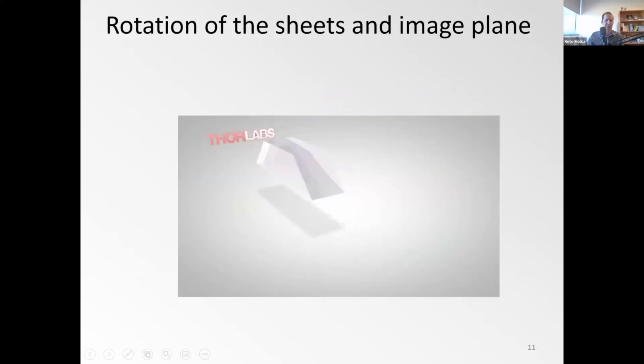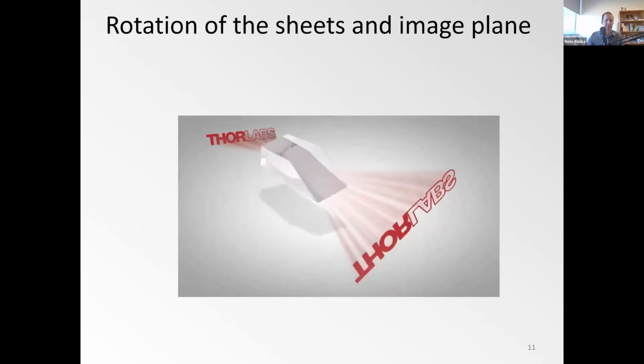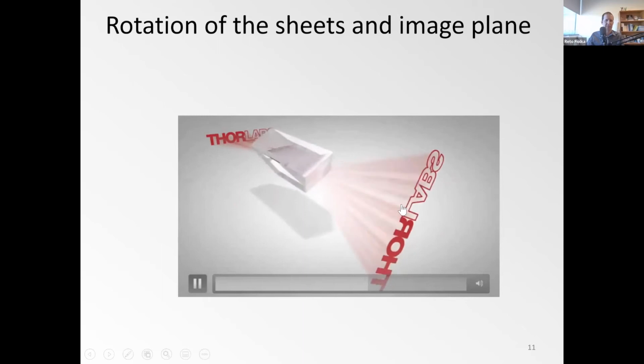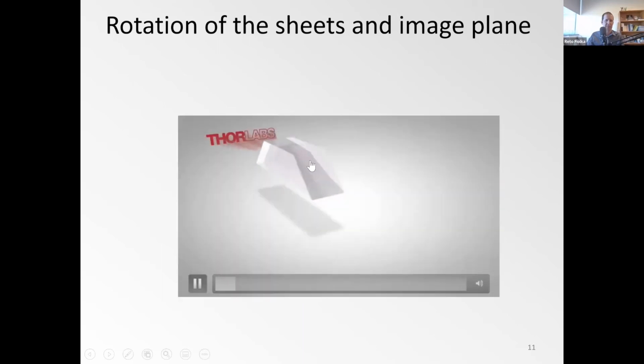Okay, so instead of rotating the tertiary imaging path or rotating the sample, what we came up with is optical elements that can actually perform the rotation of an image. And if you don't know that, then this is actually pretty neat. This here is a so-called Abbe-Koenig prism or dove prism that, if you rotate it by, say, an angle alpha along its axis, rotates the image by double that rotation angle. As you may also notice, it introduces a bias rotation. So if the image comes out, it's already flipped.